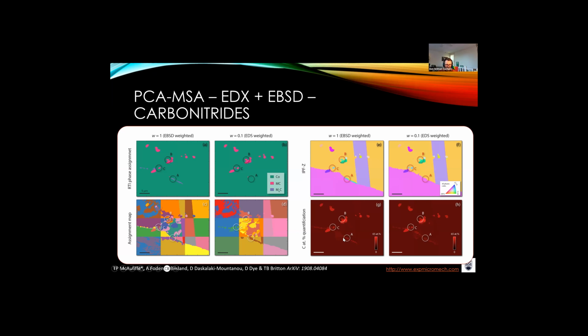So what you see is there's this right angle field. That's just because it's filled to the edge, and that's similar to the edge problem I showed you in the EBSD data example. So again, it could be fixed. It was just a RAM issue, and did we solve the problem sufficiently with the artifacts that we know? So, yeah. Great, thank you.